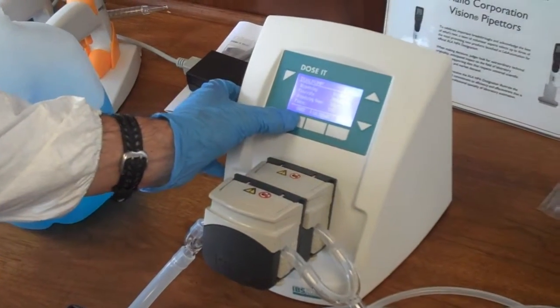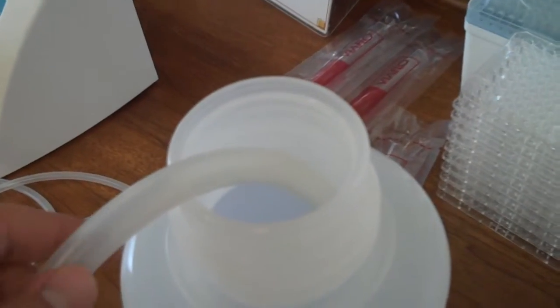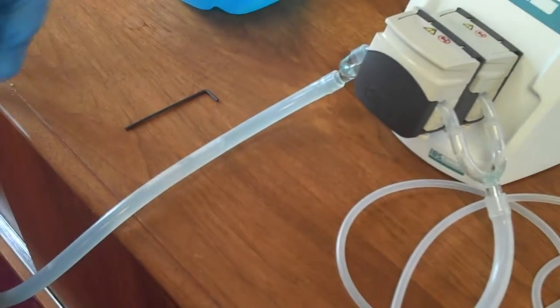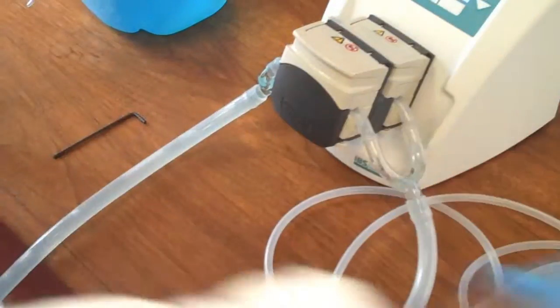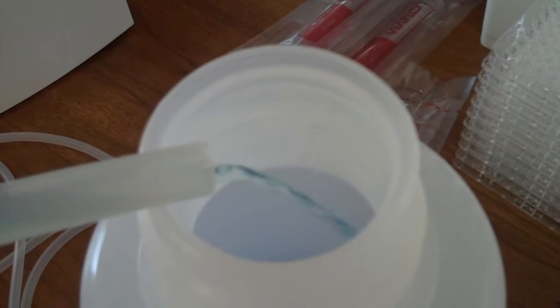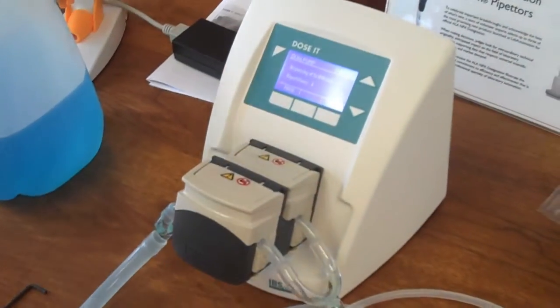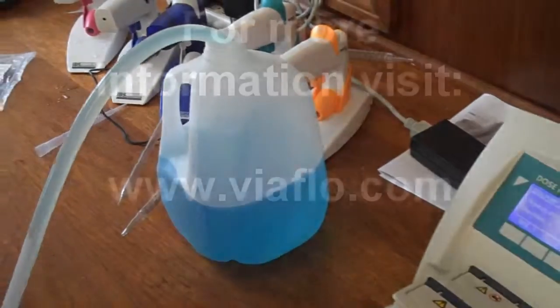So I'm simply going to start that. You can see this is a relatively slow application, a slow pump speed, but it's very gentle and easy. We're delivering liquid now, and we're basically going to add one liter to this large jug. And that's it — very simple, easy to use, and convenient. Thank you.